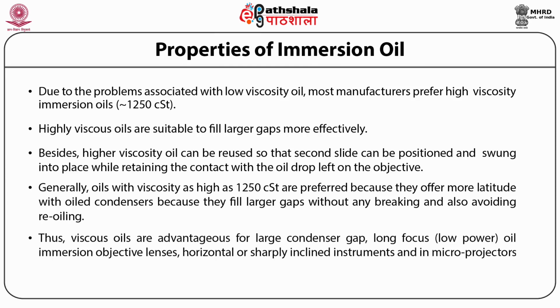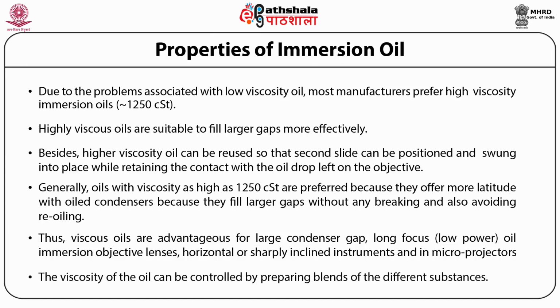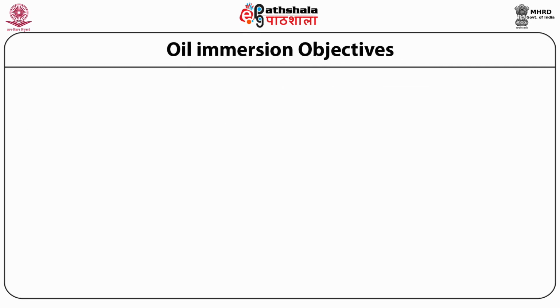Thus, viscous oils are advantageous for larger condenser gap, long focus, low power, oil immersion objective lenses, horizontal or sharply inclined instruments, and in microprojectors. The viscosity of the oil can be controlled by preparing blends of the different substances. Let us now study the oil immersion objectives.